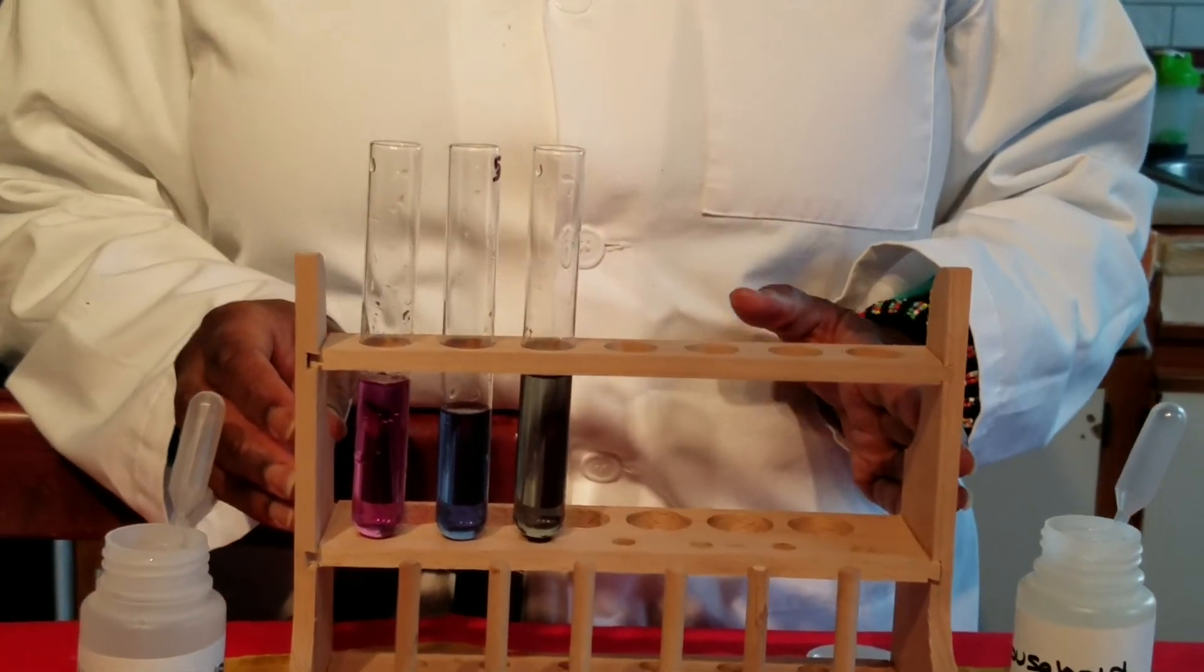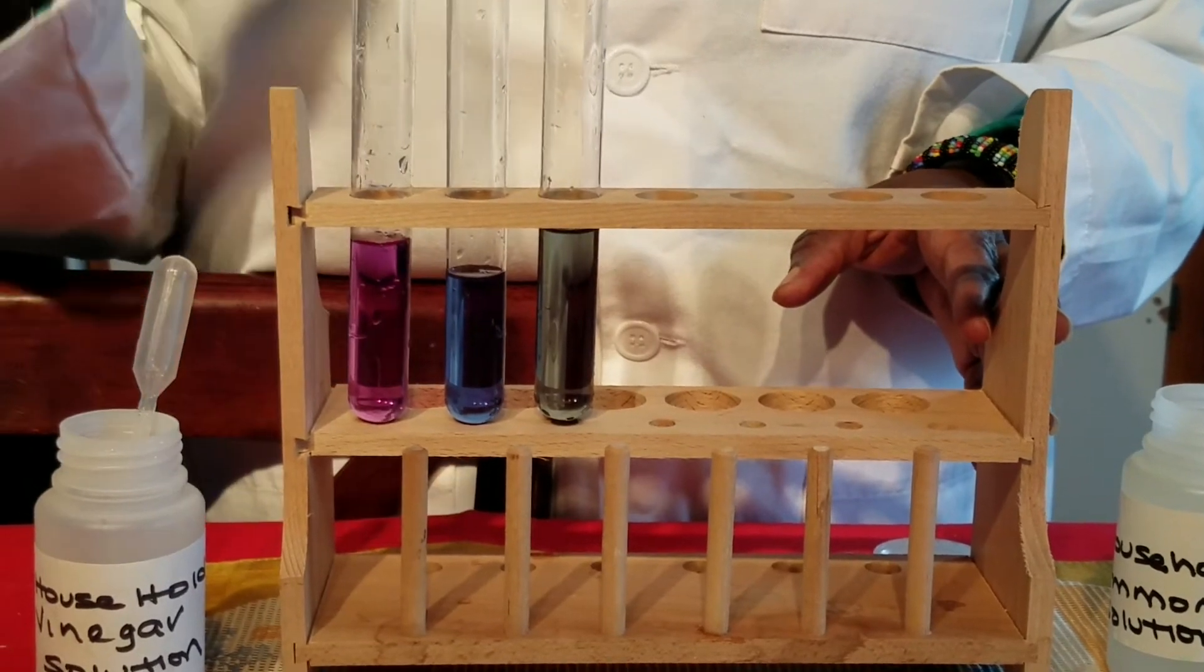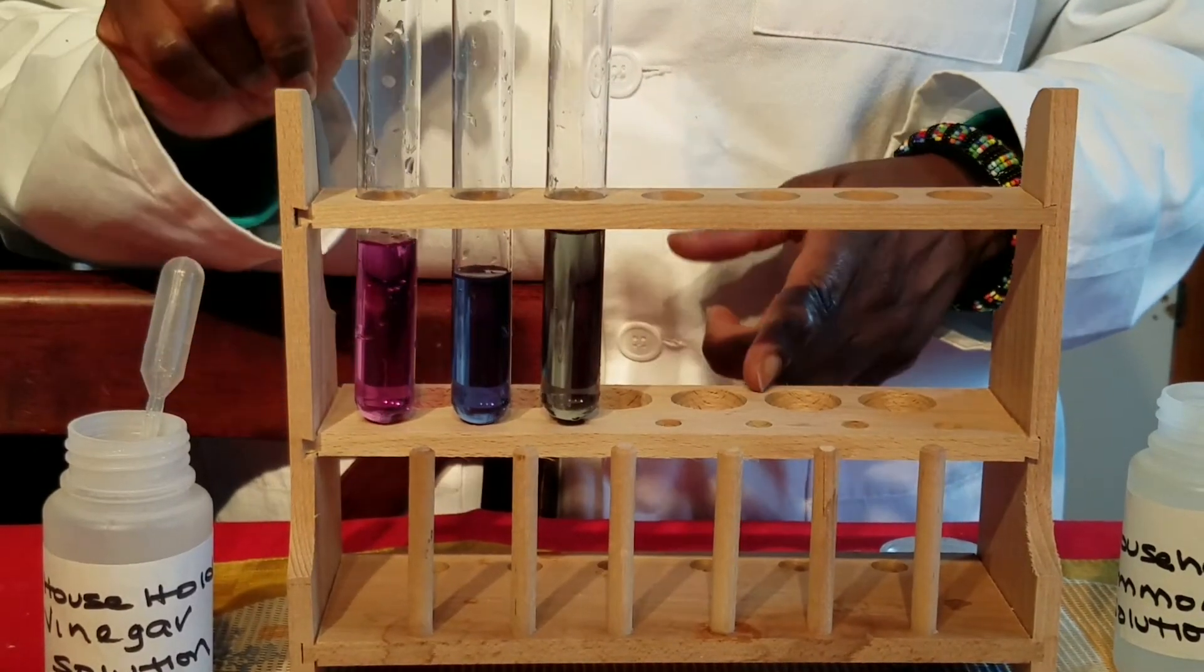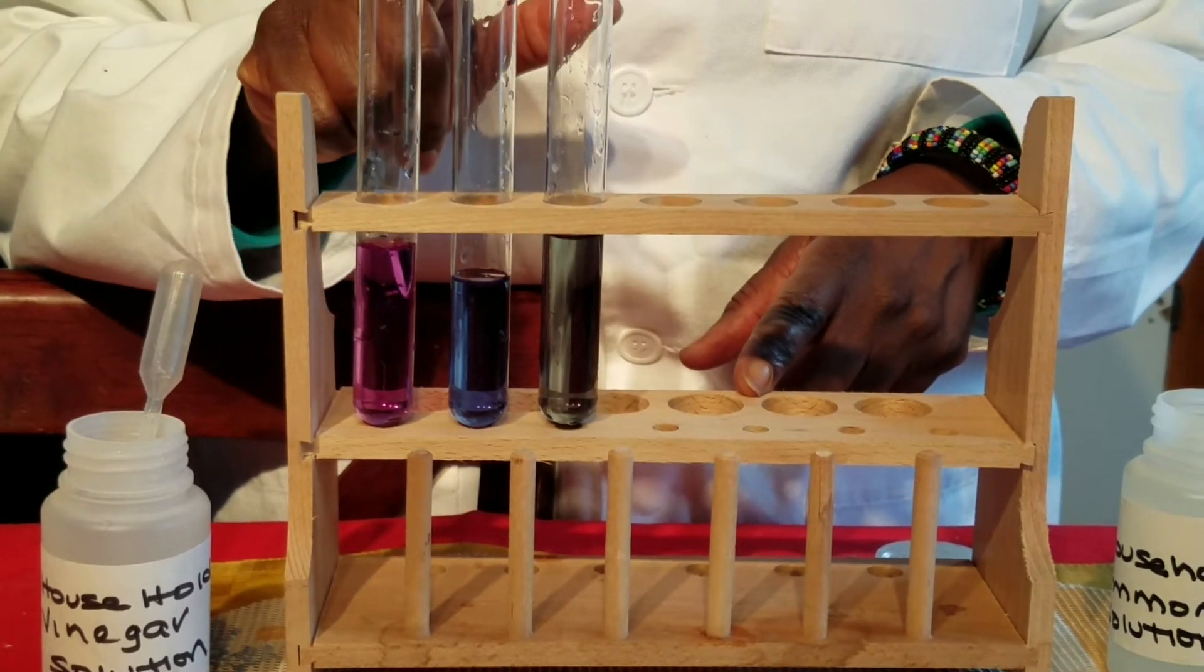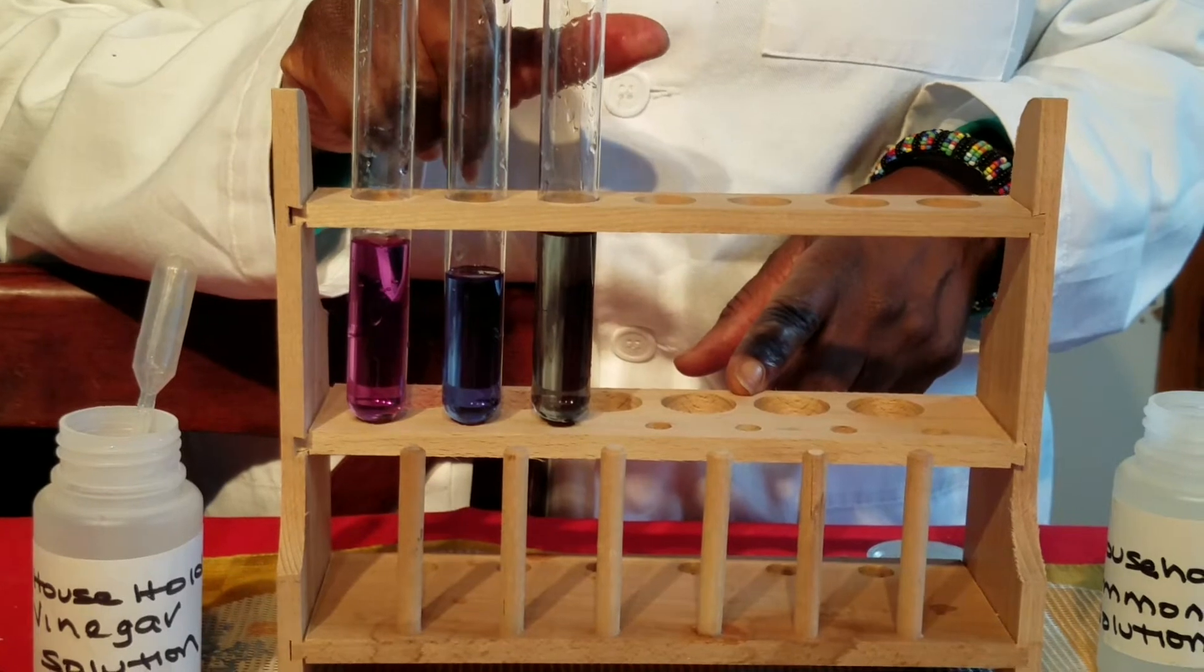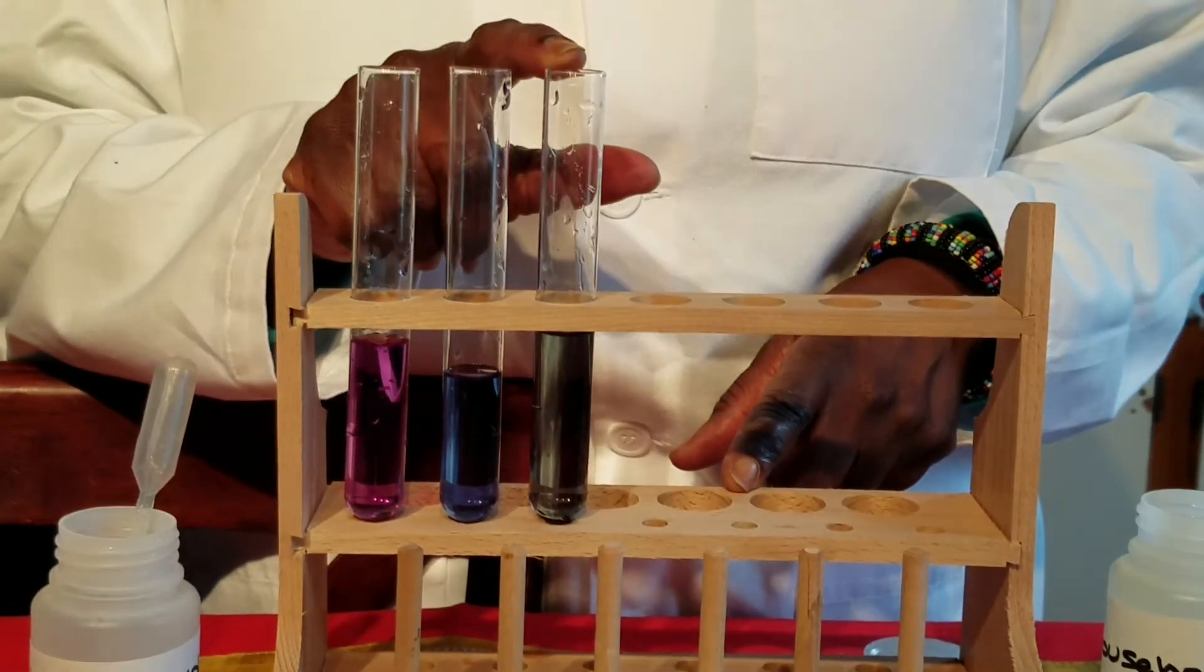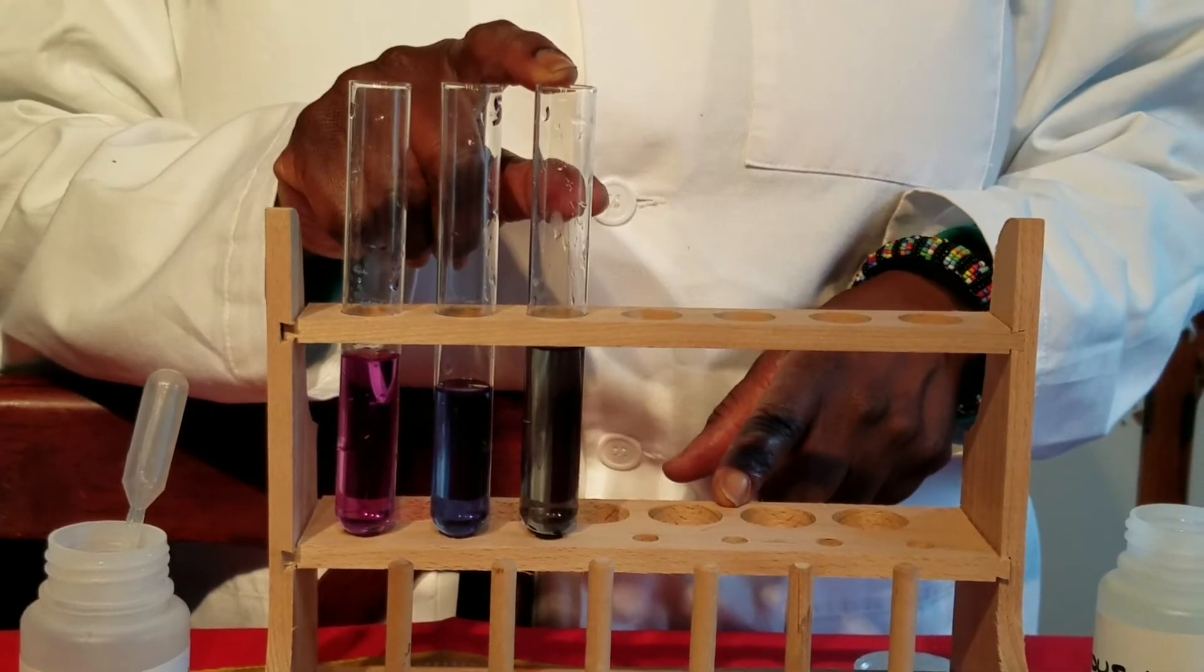And so looking at your observations, you can see that there are color changes. This is if you add acid. This is the control. And this is if you add a base. So by looking at our balanced chemical reaction, we can work on the direction in which it's shifted.